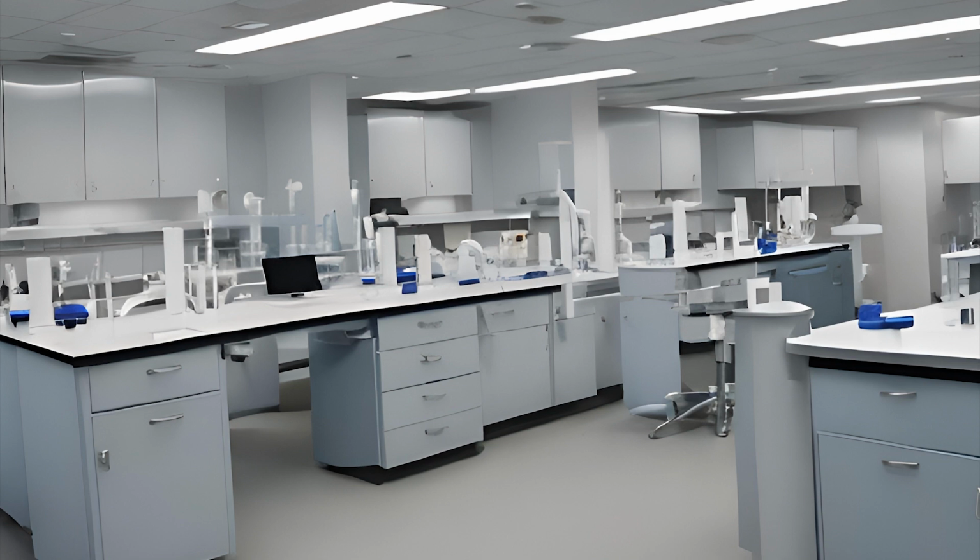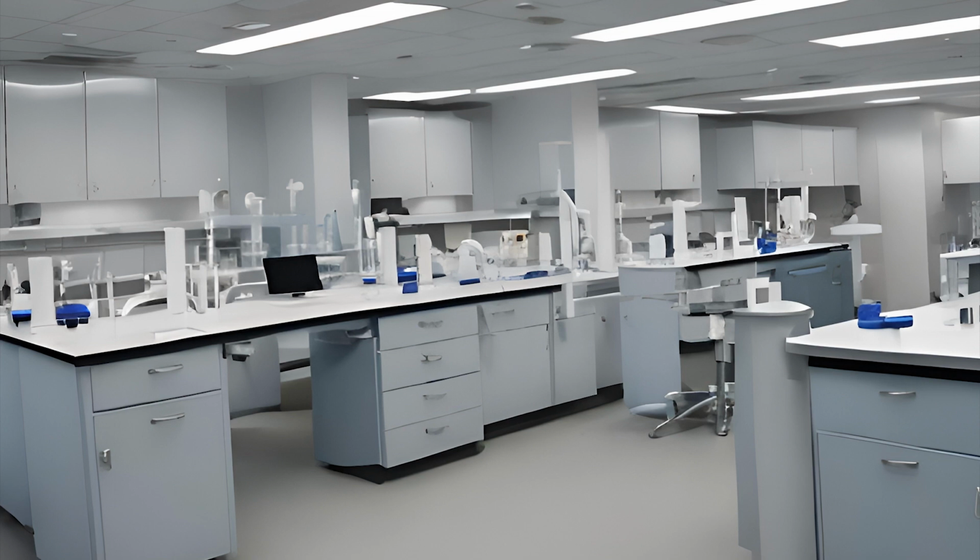The faster the centrifuge speeds are set, and the larger the rotation swing of that centrifuge is, the faster this process will occur. When you set up a centrifuge, you need to properly balance it. This is not something that I can show you just with my voice. I will describe, however, that you want to have an equal amount of weight on each side of the centrifuge, and that if you have swinging buckets in your centrifuge, you want to balance the weight over the center of those swinging buckets, so that when the centrifuge spins, the buckets have an equal amount of weight on each side of their pivot point.